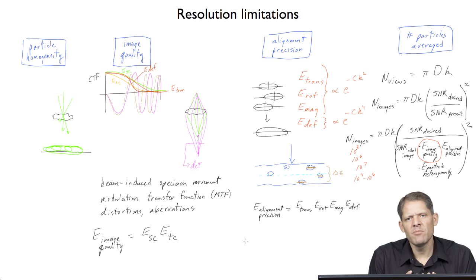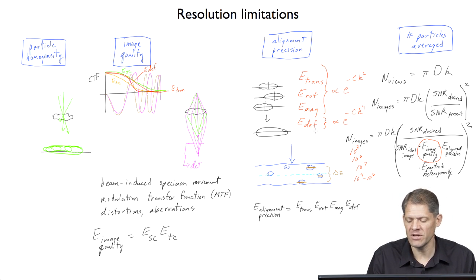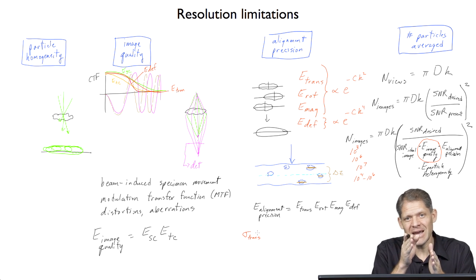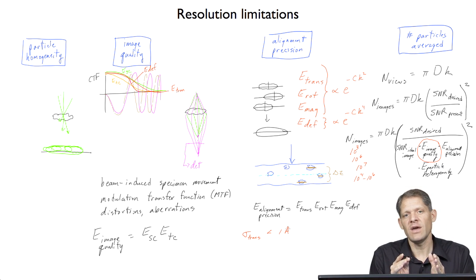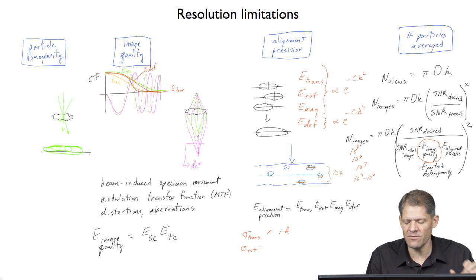states. But another bottom line practical take-home message from this kind of analysis is that we can look at what kinds of alignment errors are tolerable if one still hopes to generate a near atomic resolution reconstruction. And we can conclude that the standard deviation of translational errors, the precision to which we can detect the center of each particle, it's got to be better than approximately 1 angstrom in order to preserve the high resolution detail that will be needed. The standard deviation of rotational errors, how finely can you estimate the orientation of each particle?